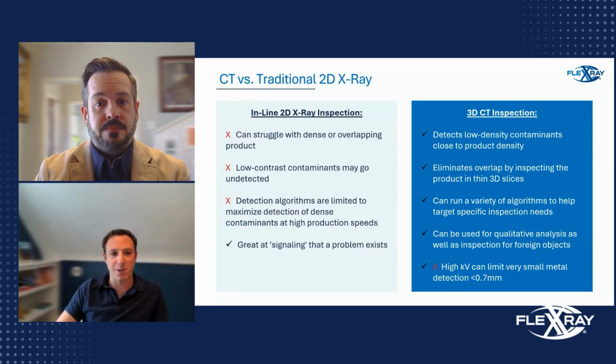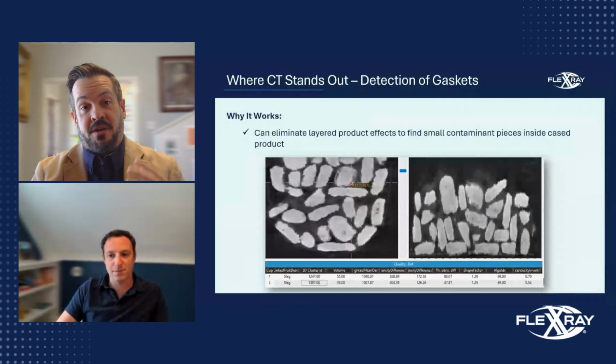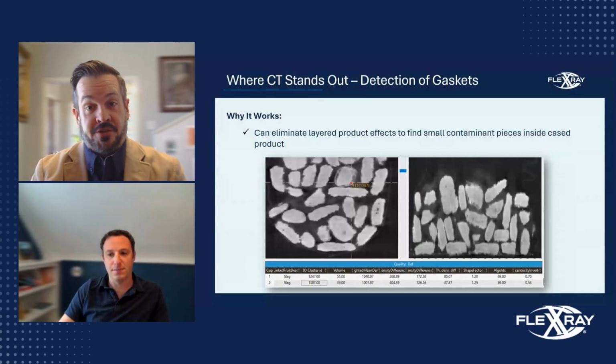But as a next piece, we want to look at first some broad areas where CT is really strong, and then we'll dive into some different industry use cases that we've seen across our different inspection projects at FlexXray facilities. So next up, let's tackle some of those high-level scenarios where CT really stands out. Yeah, absolutely. So I'm going to talk a little bit about what CT can do overall and then get into those deeper use cases that Mike mentions.